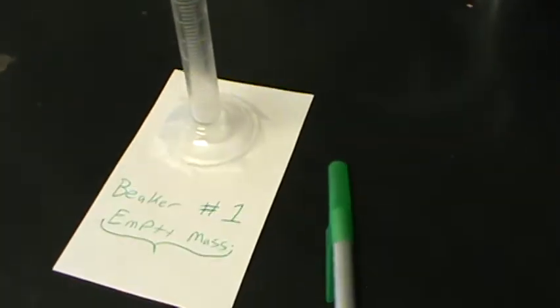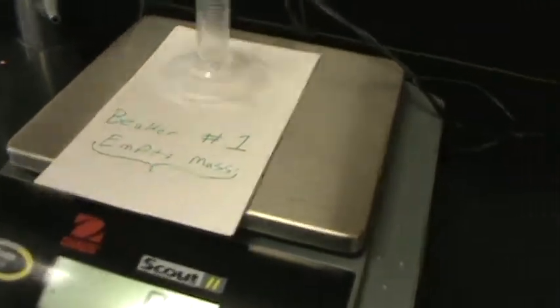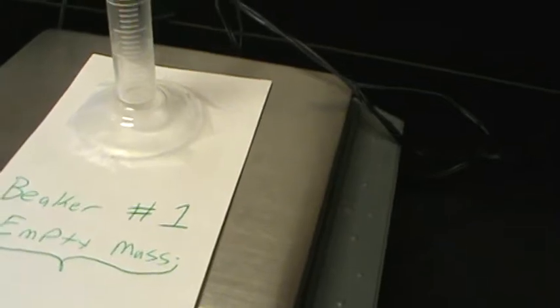Being that we're short on all that stuff, here's what I've been doing the last couple of years. I'm going to pre-fill this with some liquid, and your job is going to be to get the mass of that liquid. Now your problem is that it's currently empty. But if you were to take this and put it onto the balance, you're not getting the mass of just the liquid. You're getting the mass of the liquid and this glass and this tape and this index card.